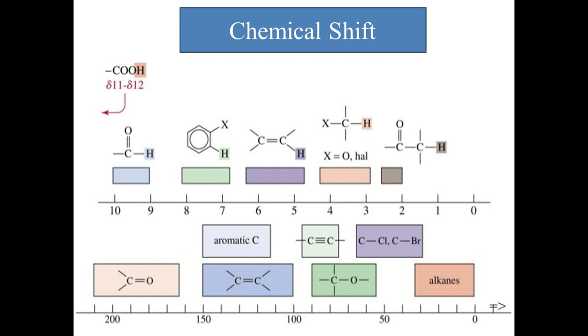So why does proton have 0 to 10? Because the proton has 100% natural abundance, so you take a minimum of about 52 seconds in spectrum scanning time. So we can collect how many protons are present in your molecule.